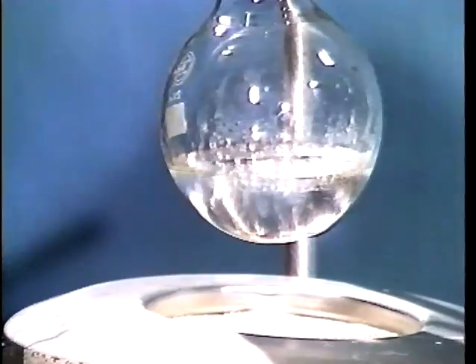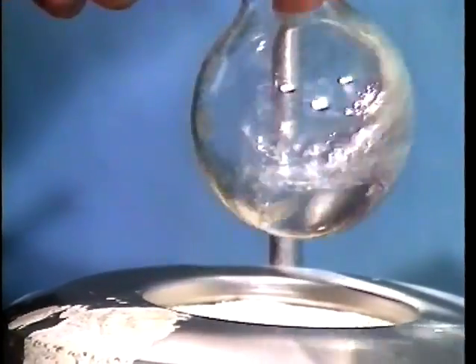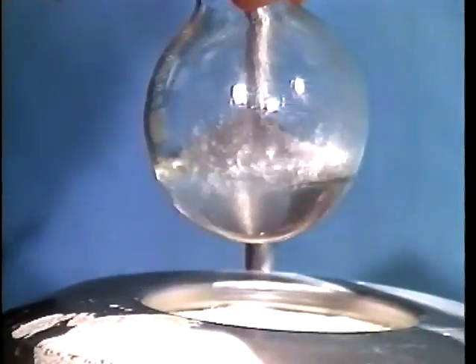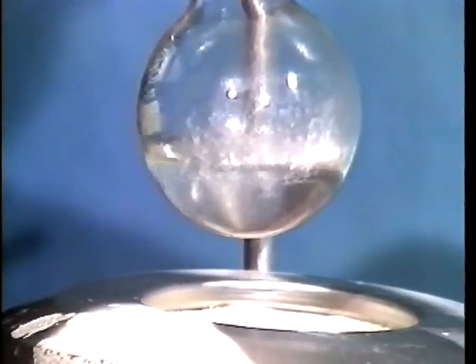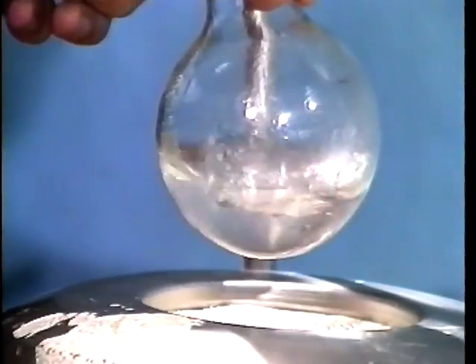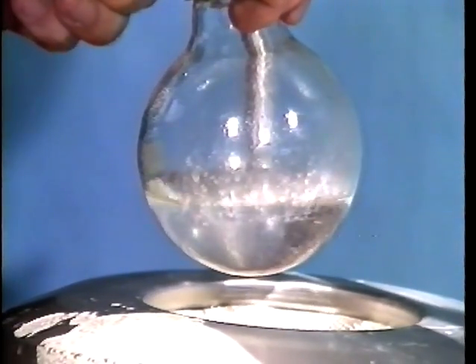When you see a turbidity in the solution, bring the solution back to the boil.